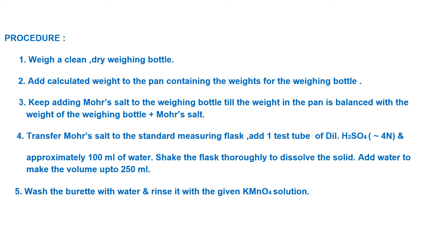Transfer the weighed salt to the standard measuring flask, which has a long neck. Add one test tube of dilute sulfuric acid to it so that the Mohr salt does not get hydrolyzed. Add approximately 100 ml of water to allow space for shaking and mixing the contents properly. After mixing, make the volume up to 250 ml using the mark on the neck of the measuring flask. Do not make it 250 ml at the start — add less water first, mix, then dilute to 250 ml.